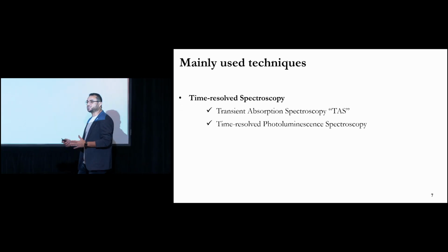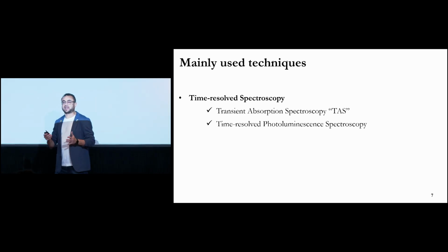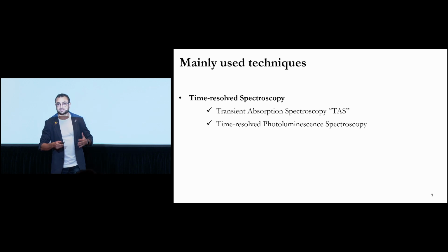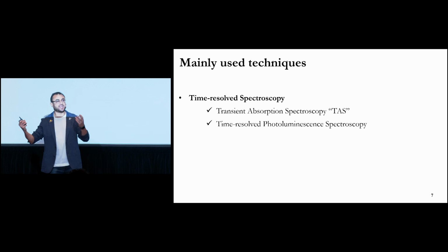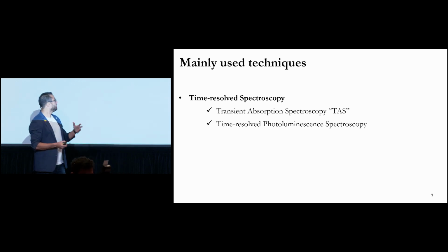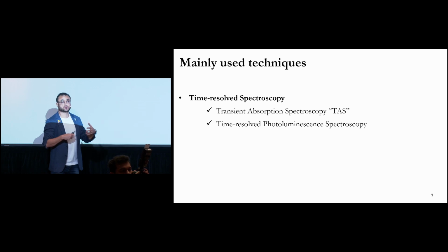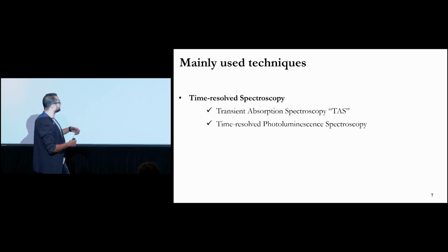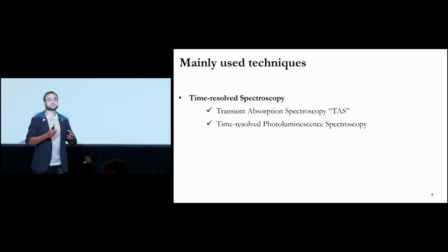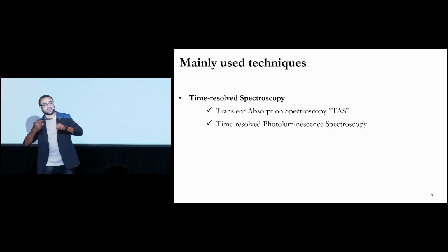When it comes to techniques, I work with laser spectroscopy, which means I try to use light or ultra-fast laser pulses to understand matter, because the reaction of light with any matter is very fast. It's on the femtosecond time scale. In that kind of time order, you need to use something even faster. That's why I got interested in different techniques, one called transient absorption spectroscopy, the other time-resolved spectroscopy, where you use ultra-fast light pulses to see the interaction between the light and the matter.